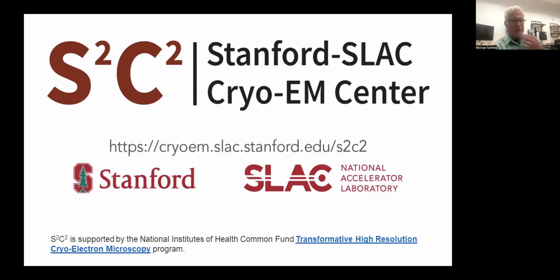Hi, I'm Mike Schmidt. I'm one of the co-directors of the Stanford SLAC Cryo-EM Center, and we just finished running the acceptance tests on our fourth and final Krios. The engineers have been very busy, and they are moving on now to installing and commissioning our Glacios. And after that, they'll commission our Tundra. So we'll have four Krios, a Glacios, and a Tundra for our high resolution and screening and training scopes.